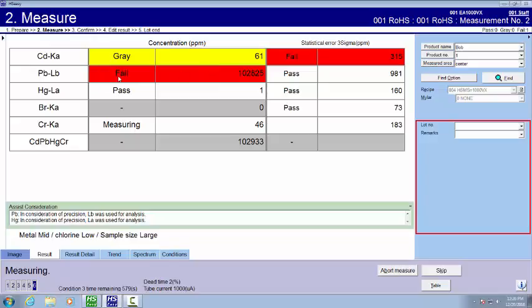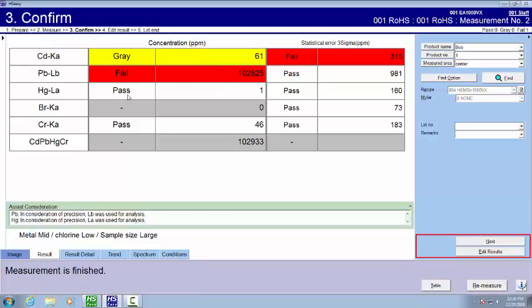The lead has obviously failed and the mercury has obviously passed based on our criteria that the user sets up. Each one of the customers has their own criteria that they can accept. And you can edit it at will.